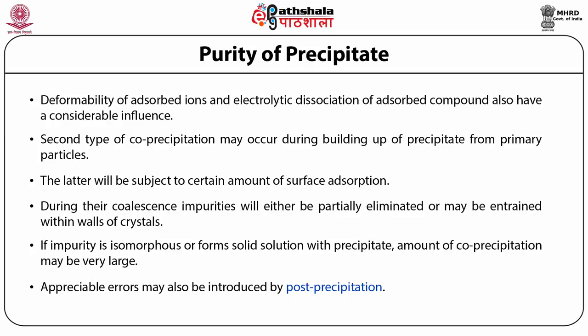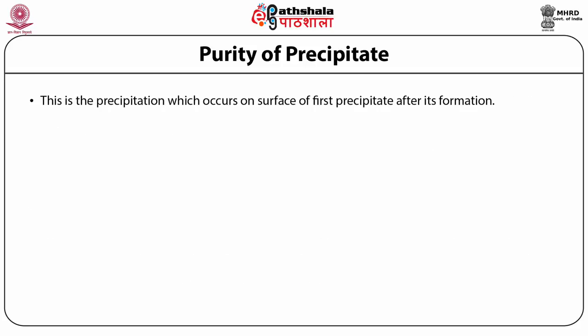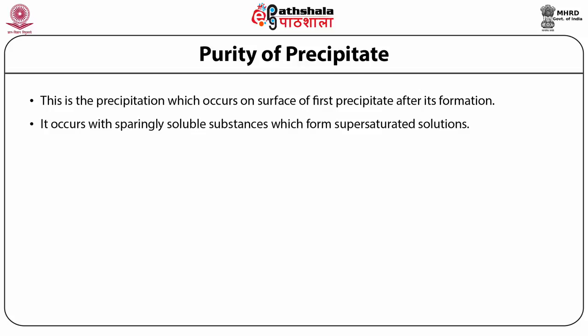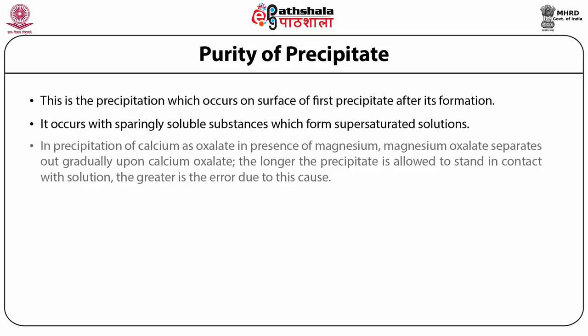Appreciable errors may also be introduced by post-precipitation. Post-precipitation is precipitation that occurs on the surface of the first precipitate after its formation. It occurs with sparingly soluble substances that form supersaturated solutions, usually having an ion in common with the primary precipitate. For example, in the precipitation of calcium as oxalate in the presence of magnesium, magnesium oxalate separates out gradually upon the calcium oxalate. A similar effect is observed in the precipitation of copper or mercury sulfide, where zinc sulfide is slowly post-precipitated.